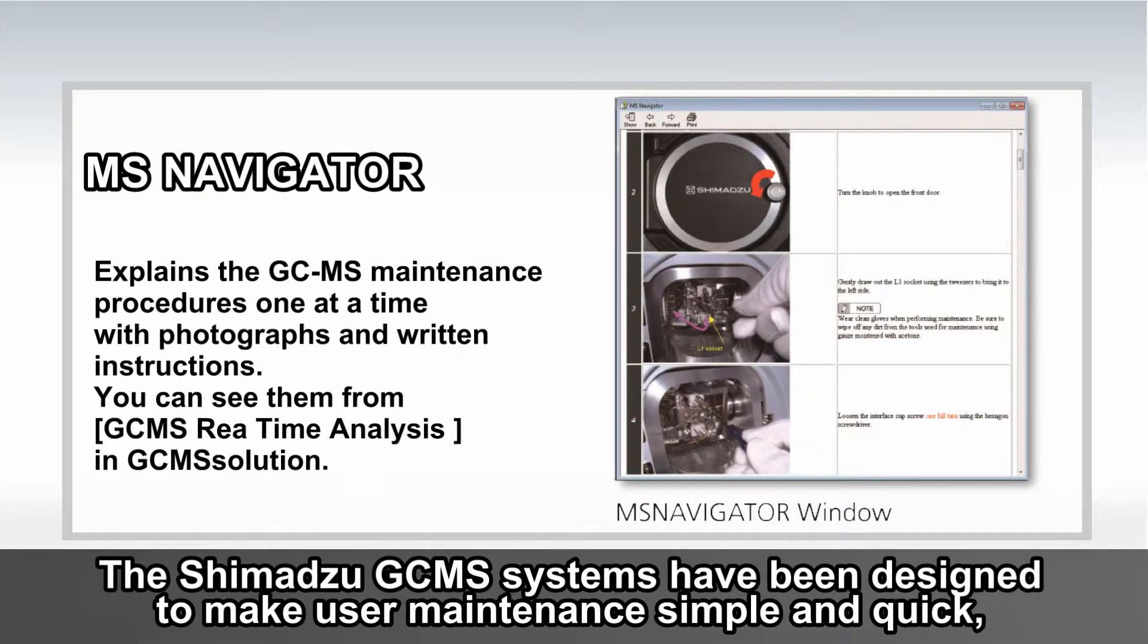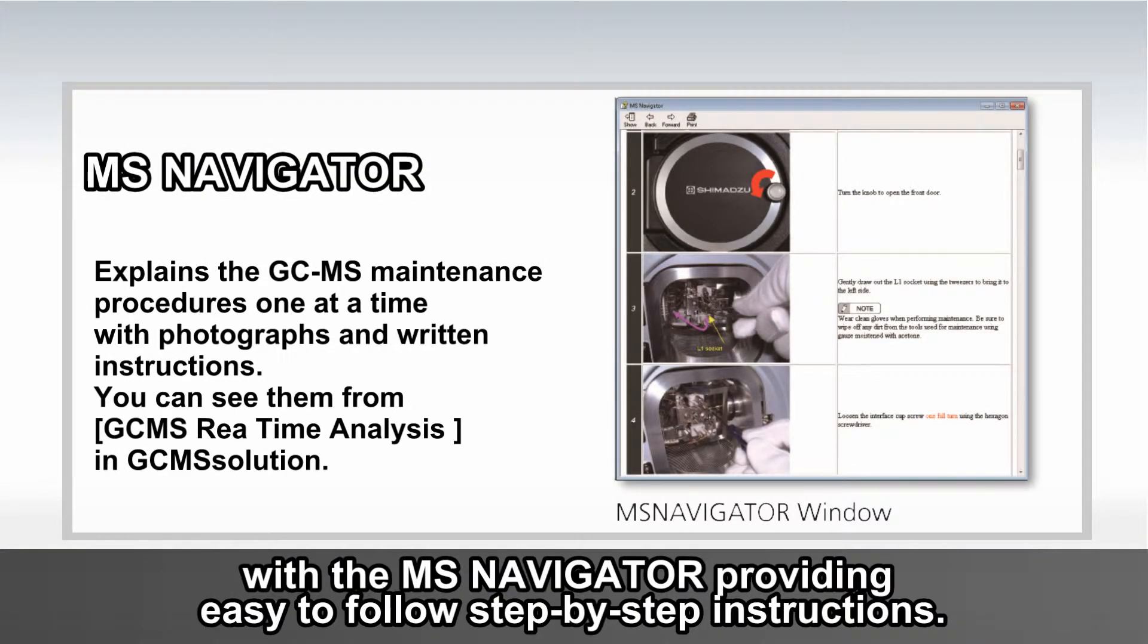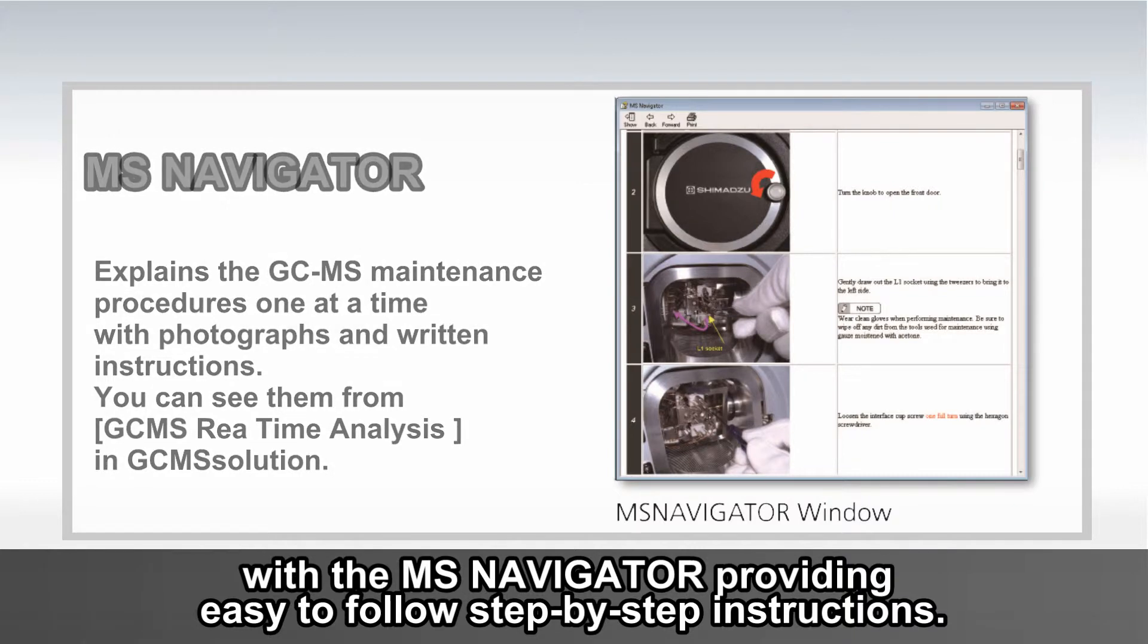The Shimadzu GC-MS systems have been designed to make user maintenance simple and quick, with the MS Navigator providing easy-to-follow, step-by-step instructions.